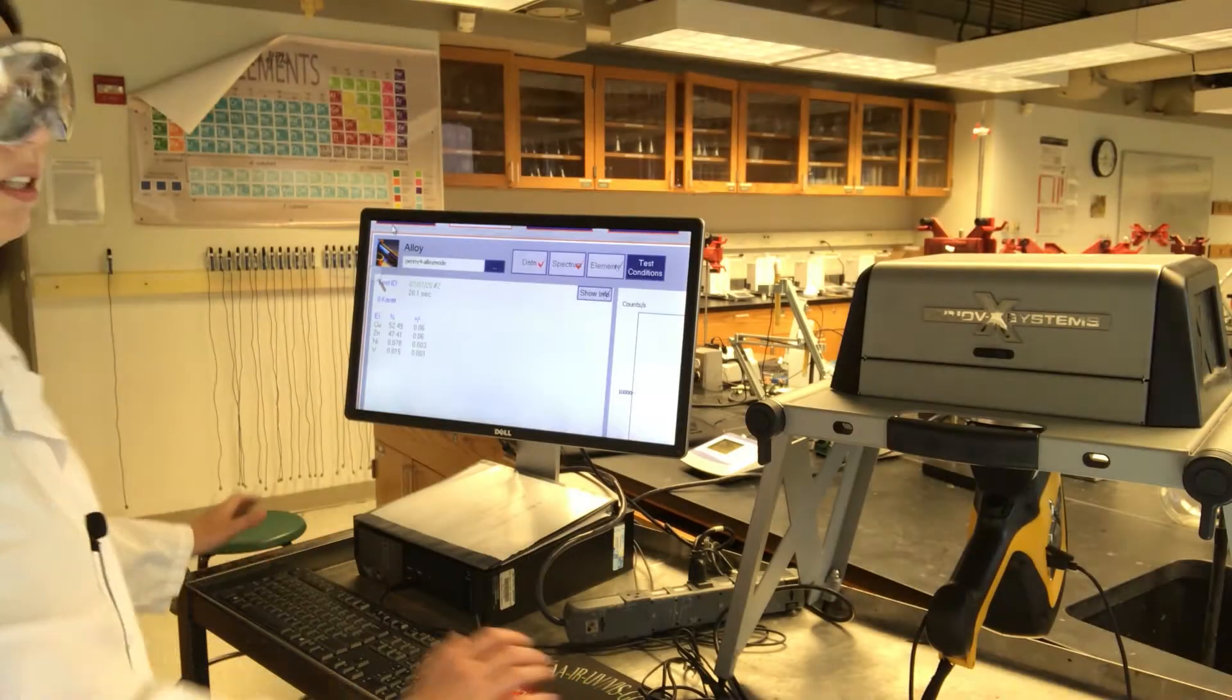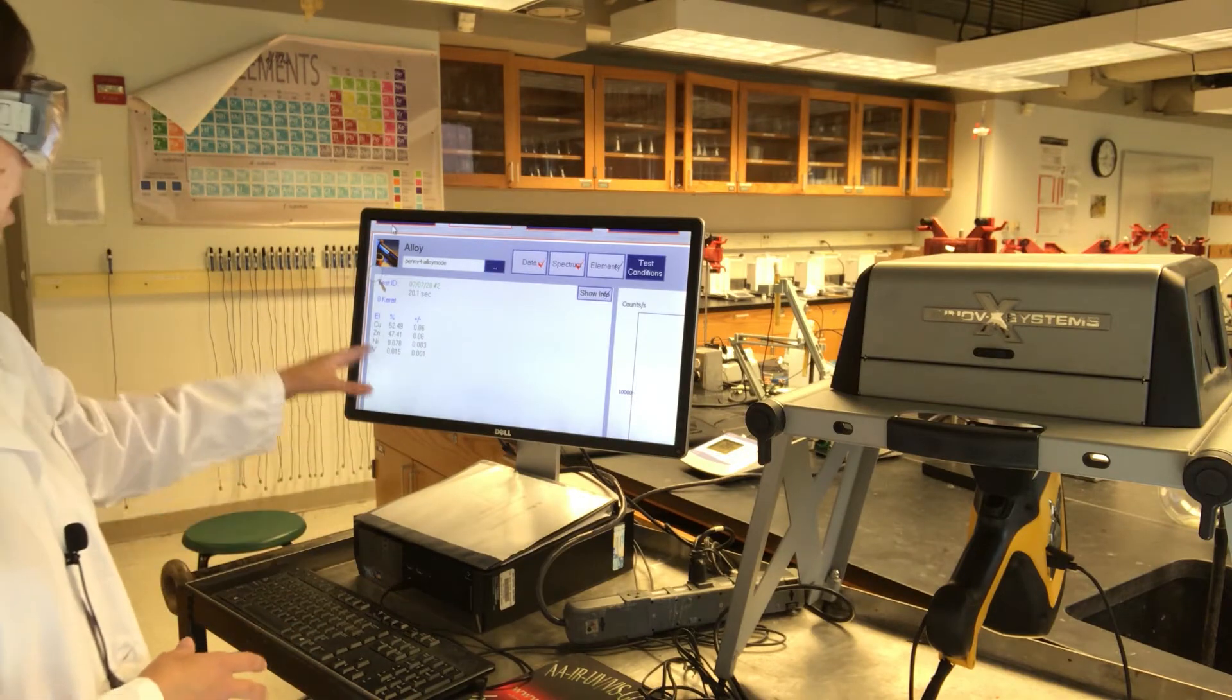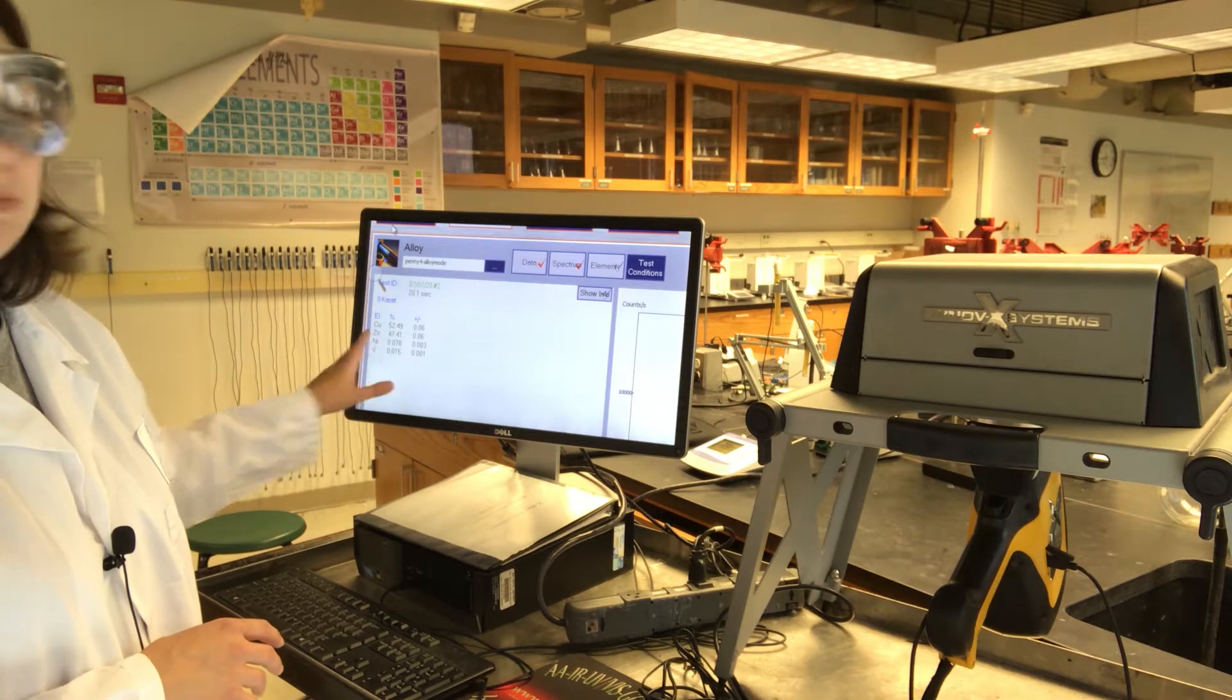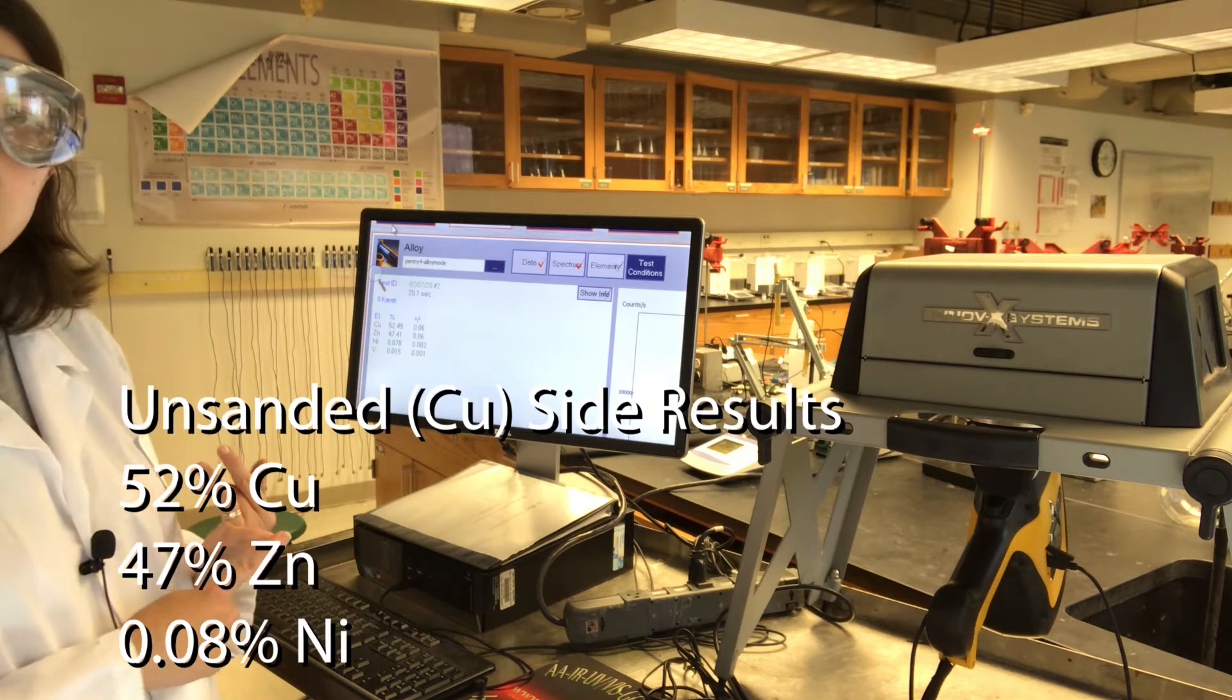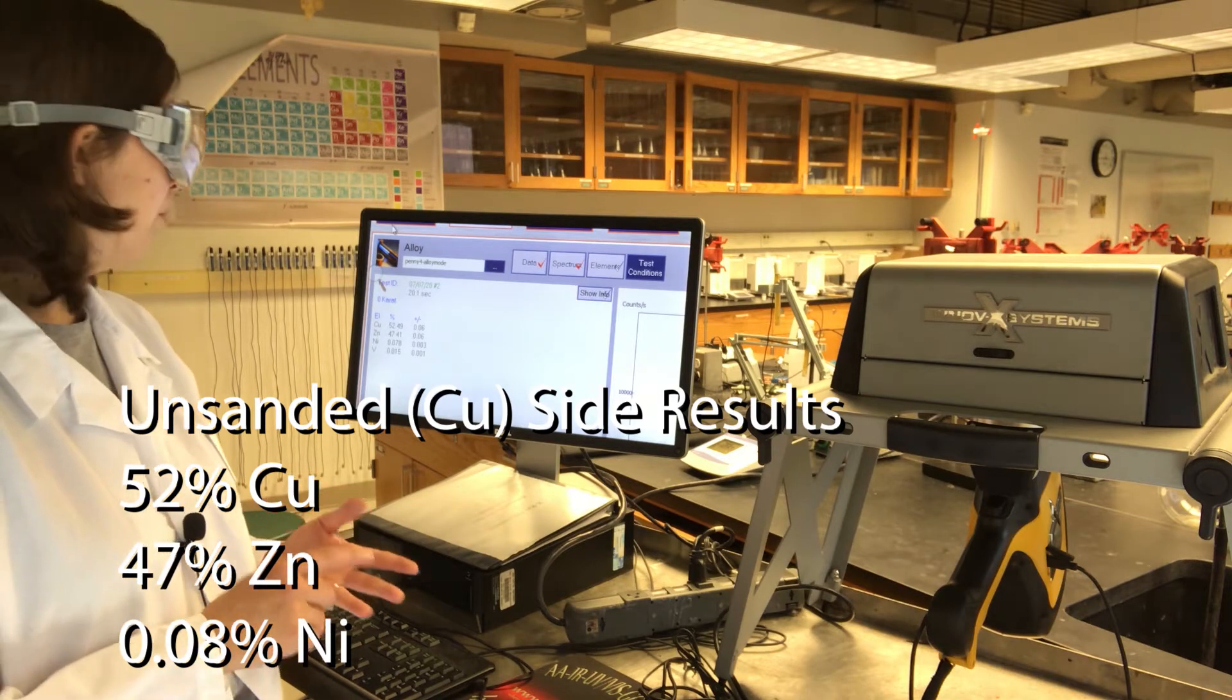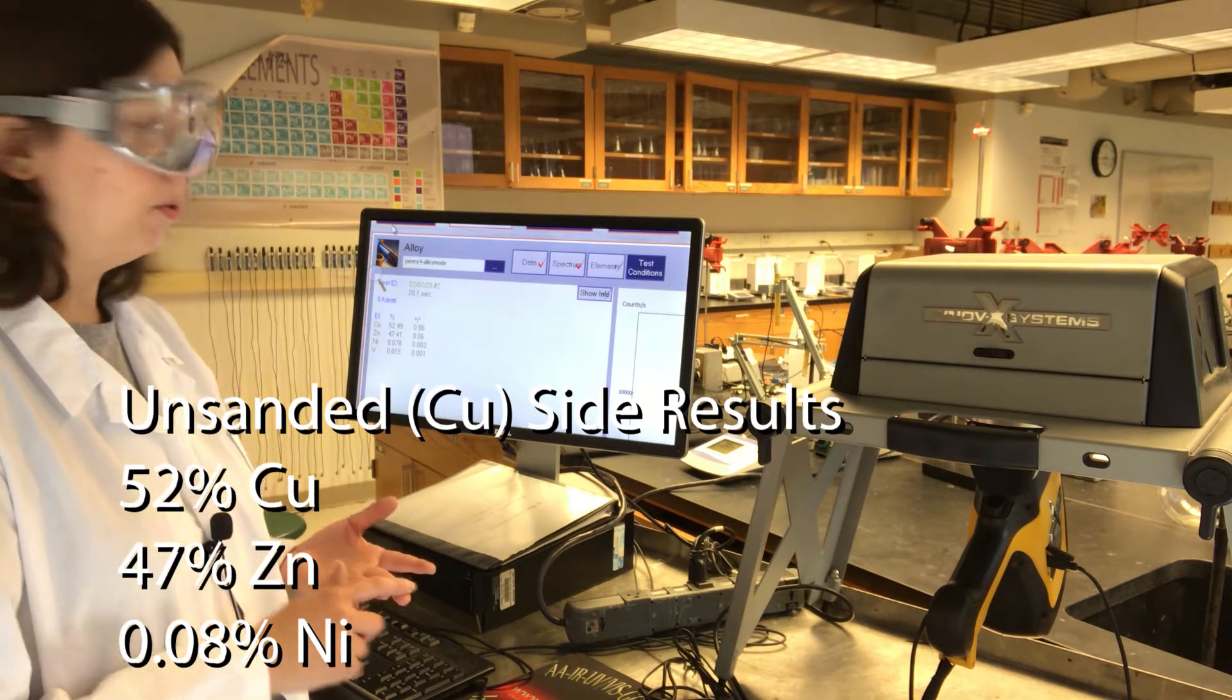The test has completed. The data are displayed here in terms of percent of each metal. We have 52% copper, 47% zinc, and 0.08% nickel.